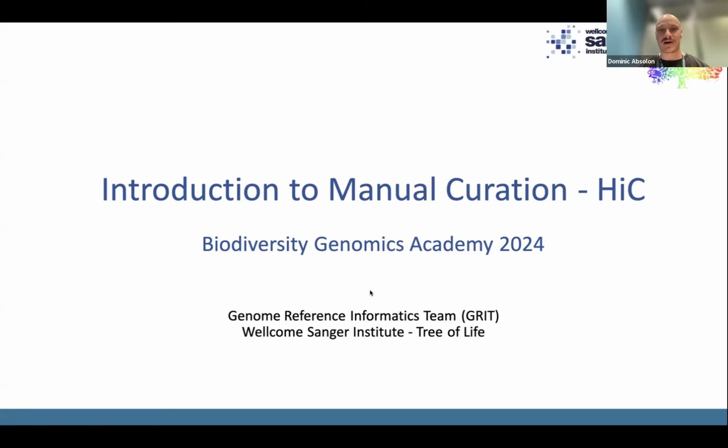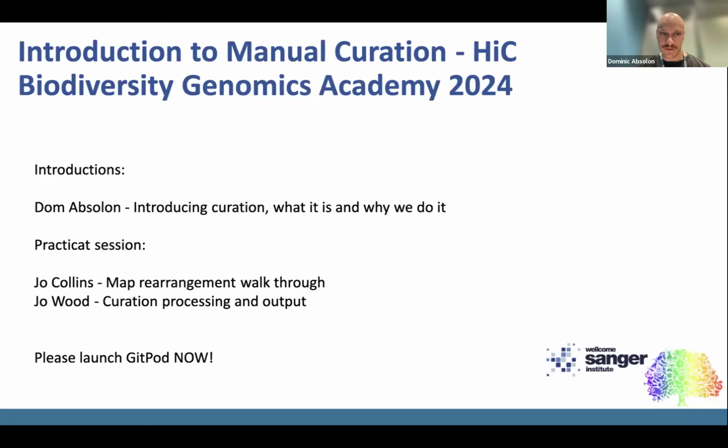The session's being run by, as you can see, the Genome Reference Informatics Team here at the Sanger Institute. We delightfully call ourselves GRIT for short. My name's Dom. I'm one of the curators here. I'm going to run through an introduction to curation, what curation is, and why we do it.